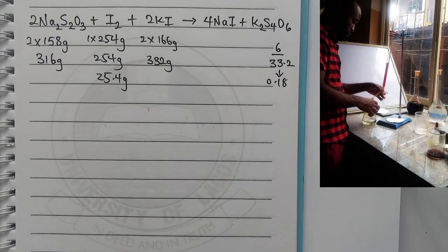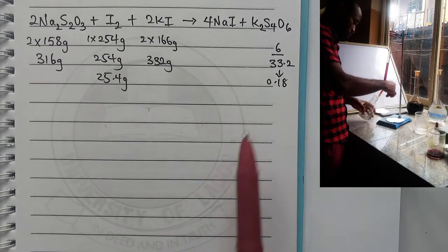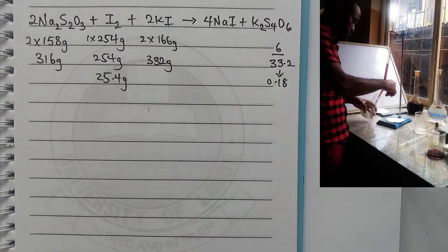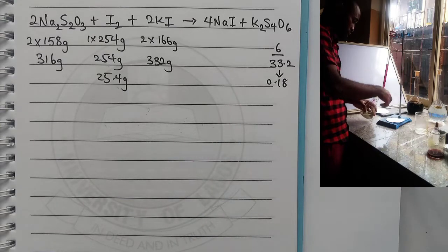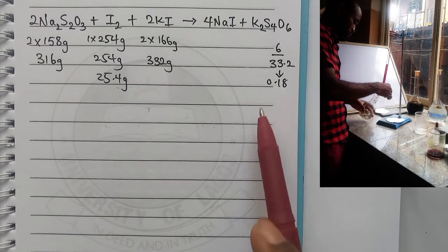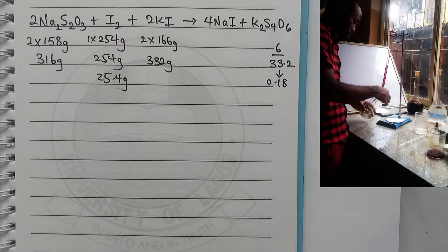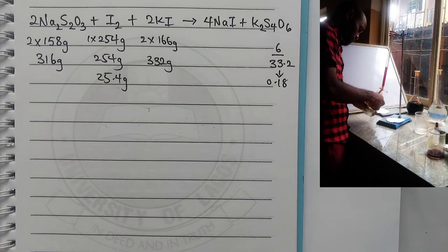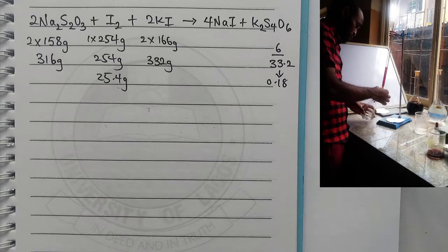The percentage would have been 18%, as you can see here. If you multiply this by 100, it will give us 18. It would have been 18% just by normal calculation. By the strong work I did, it gave me that 45%. Now this 18%, if you have used the normal one without following the pattern I showed over there, the volume of solution A used will be going towards 60, 70, 80, even 100.